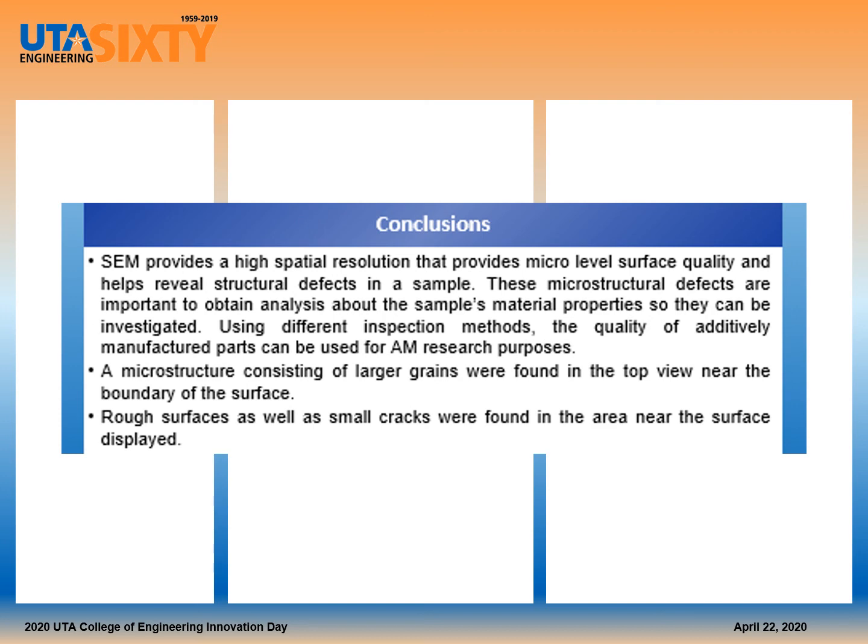A microstructure consisting of larger grains was found in the top view near the boundary of the surface, while rough surfaces as well as small cracks were found in the area near the surface displayed.